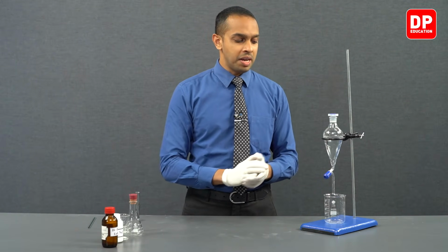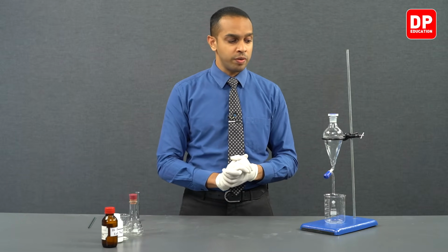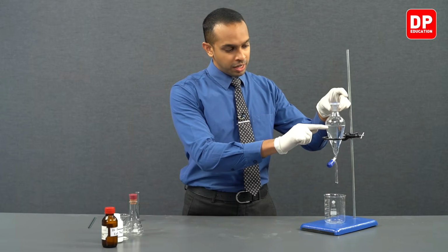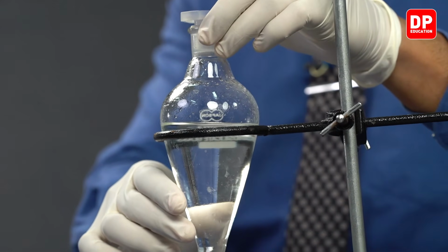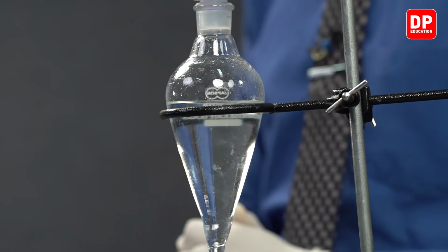Now students, we have allowed this mixture to settle for a while, so we can observe two layers. Over here we have a very small diethyl ether layer, and at the bottom you can see an aqueous layer, and you can very clearly see that the aqueous layer is now very clear.